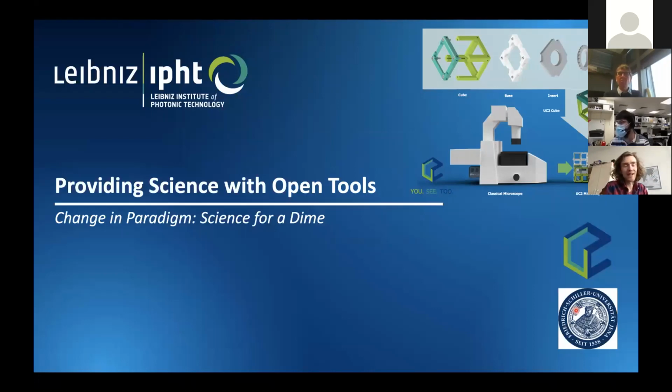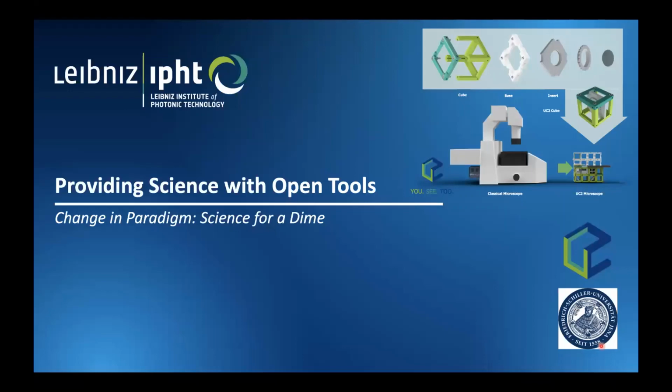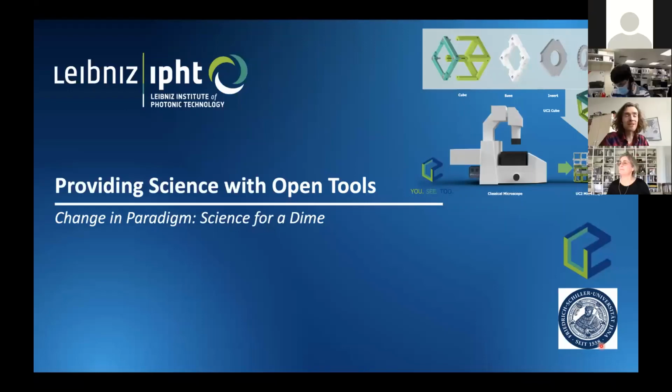The title, of course, is The Power in Your Pocket, because most of it is based on cell phones as very powerful imaging devices. Nevertheless, I'll divide it into a few different topics. I would like to tell you why open science is so awesome and what you can do with your cell phone in terms of single molecule localization microscopy, and how you can use this new type of cube in your research very soon. Let's directly dive in.